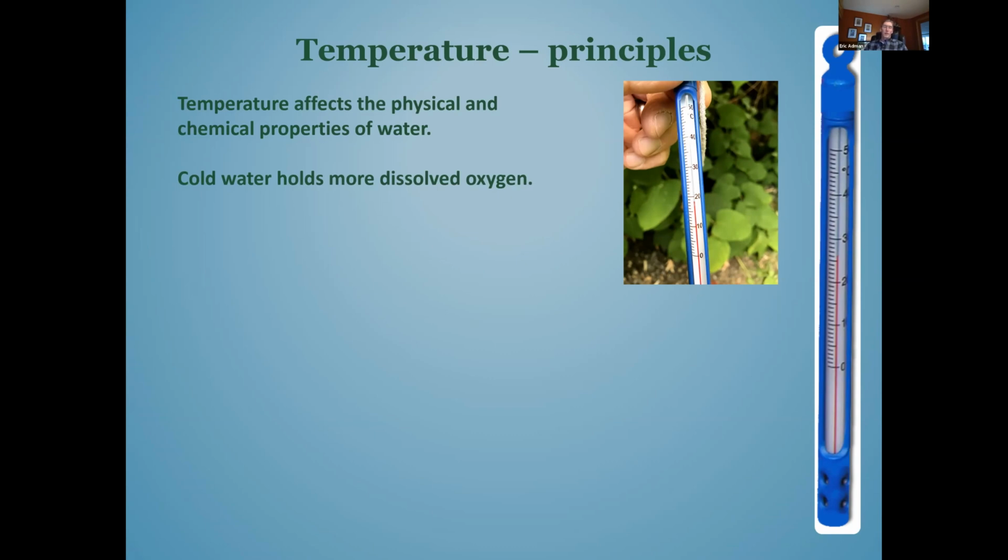One major factor is that cold water holds more dissolved oxygen than warm water does. Another factor to be aware of is that our test reactions happen more slowly in cold water, so you may have to give reactions a little bit more time when you're testing in cold water.